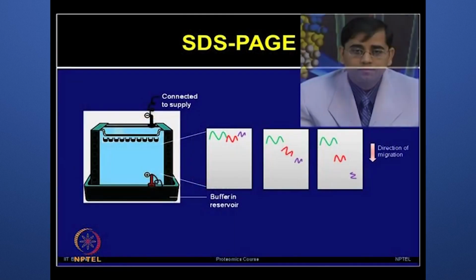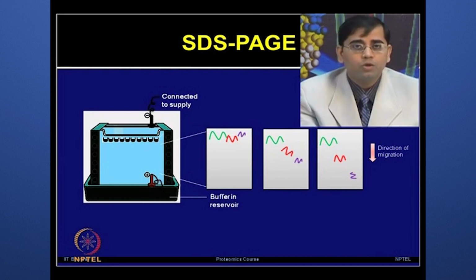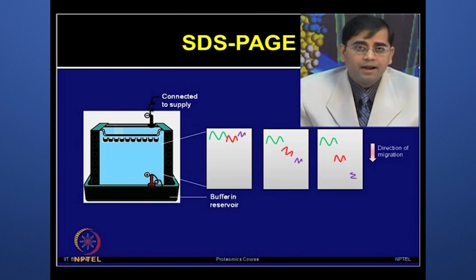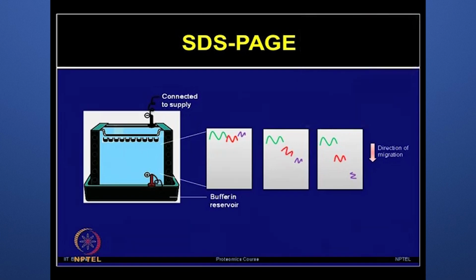Once this protein preparation is done, then you can load this protein on the SDS page gel, and based on the molecular weight, the lower size proteins will migrate the furthest and the higher molecular weight proteins will remain near the top surface of the gel. So, depending upon the protein size, you can separate the proteins based on the lower and higher molecular weight in this SDS page gel. You can add the standards or known molecular weight proteins to determine your unknown proteins.